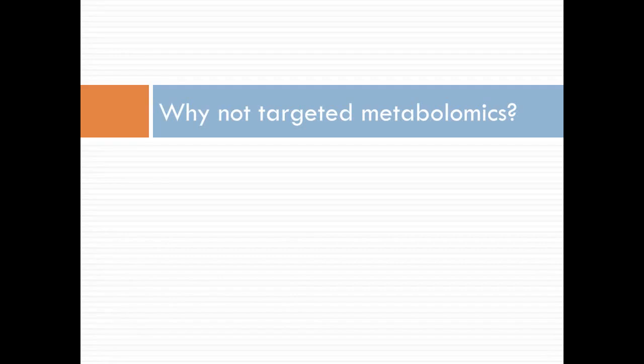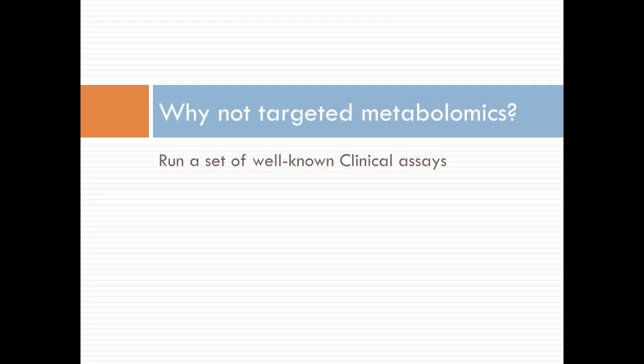So you're starting to get more of a visual picture. And as was mentioned earlier, I do imaging mass spectrometry. It's also metabolomics, and I think an image tells you many different things and can be easier to express. And so we have to create a better image of health to show us what the spectrum of health really looks like. And so here we're starting to see a better expression of that health.